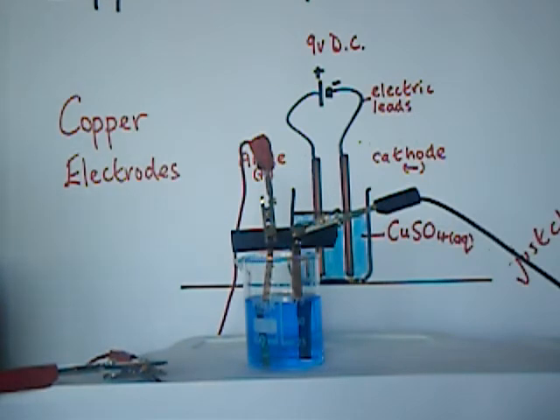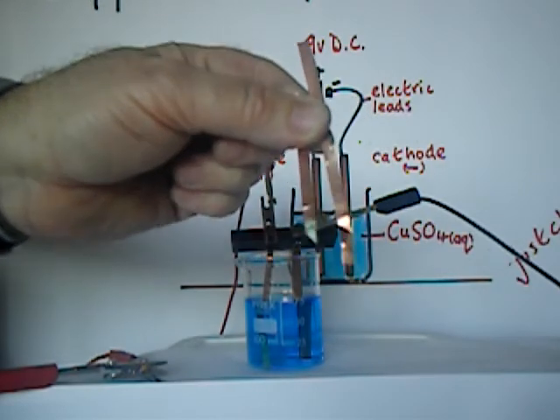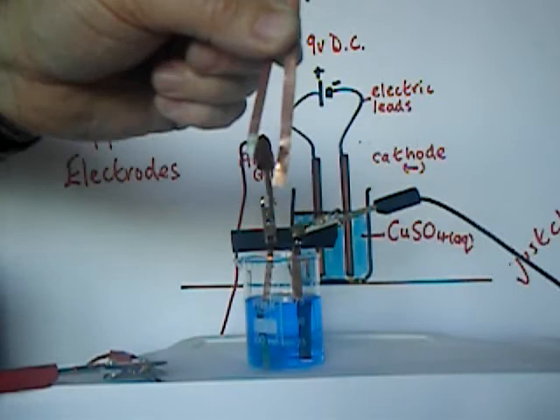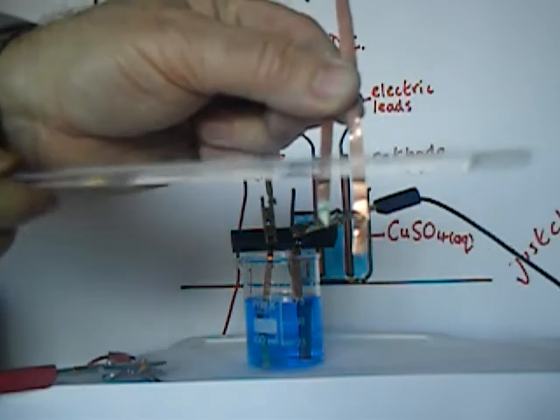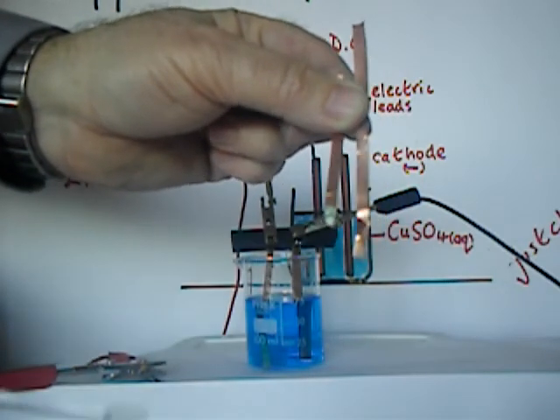And I'll show you what the result was. As I show it now to you on camera, the electrodes had been the same length. And this is what I've got after about two hours. You can see that the left-hand electrode, in fact, has worn away at the bottom. They were immersed at about this depth here. And this has completely dissolved away.